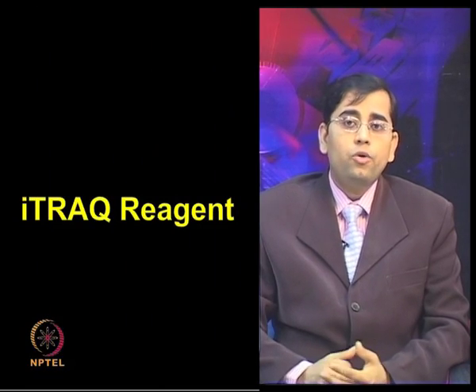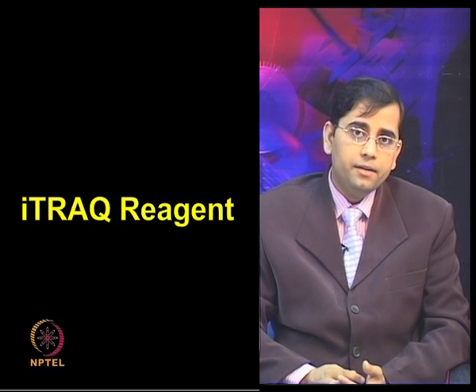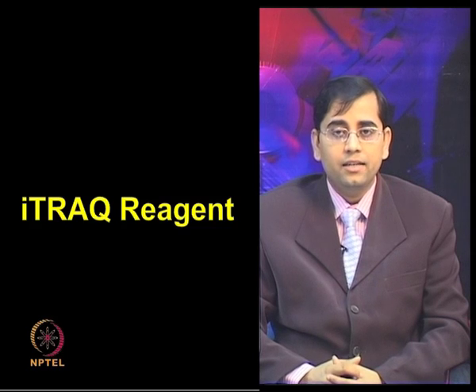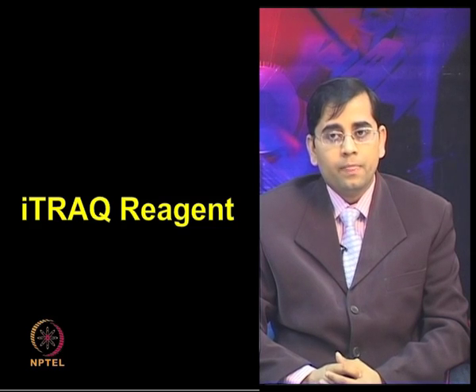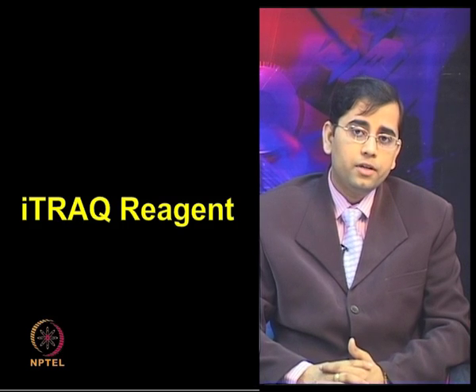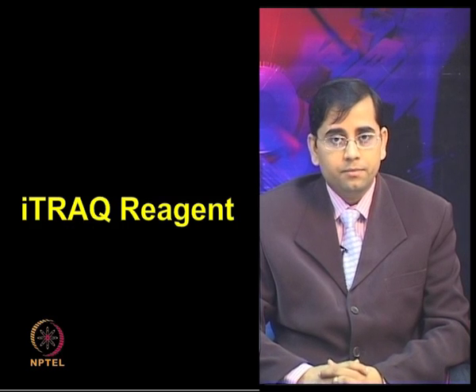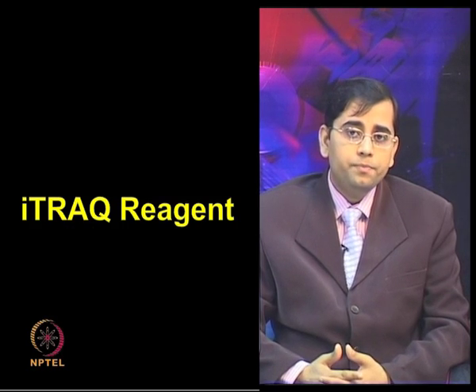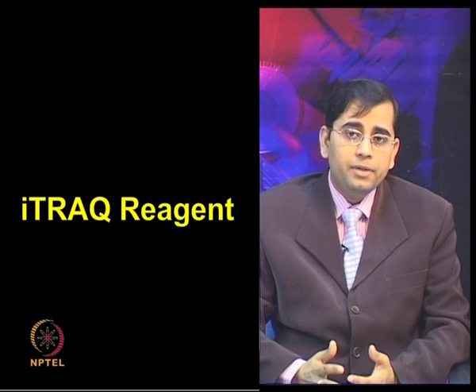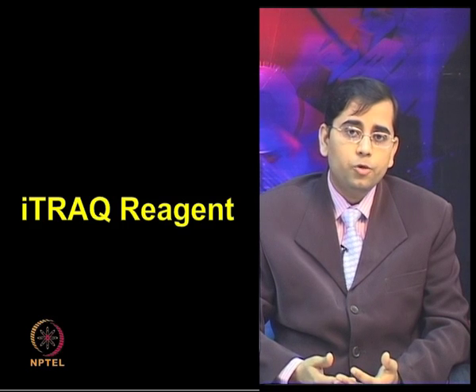There is a set of 4 isobaric amine specific labeling reagents: 114, 115, 116 or 117. The iTRAQ reagents consist of a reporter group, a balancer group and a peptide reactive group, PRG. The peptide reactive group labels the N-terminus of all peptides as well as the free amine group of lysine side chains.